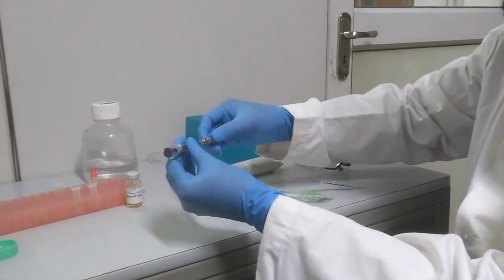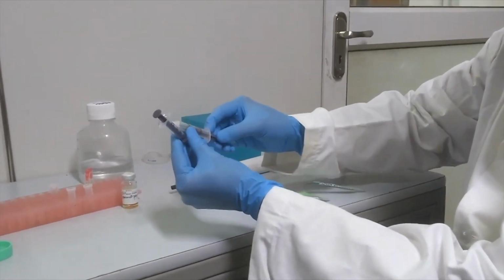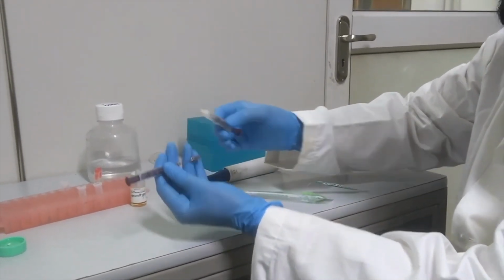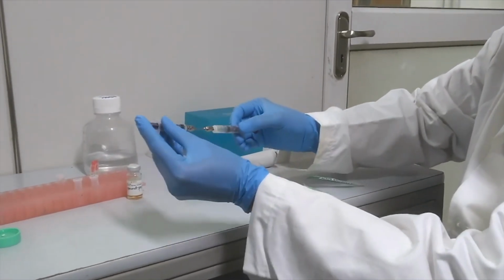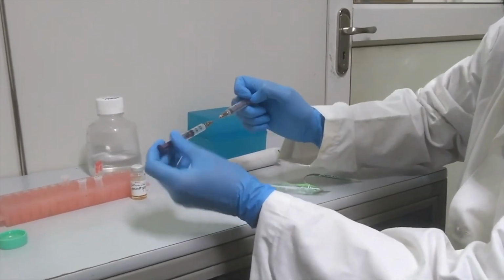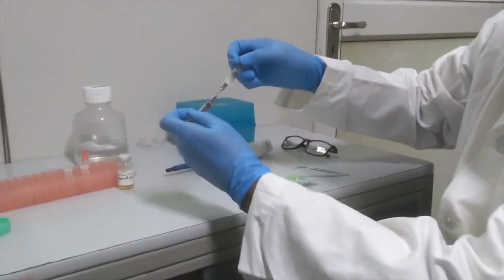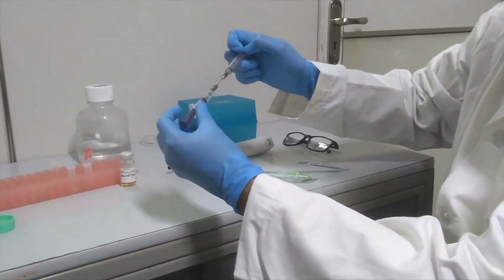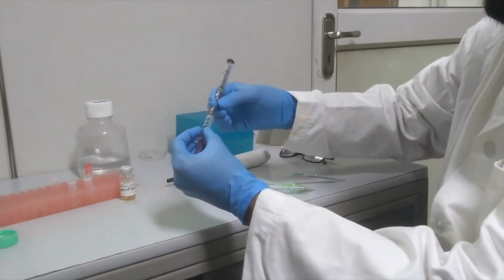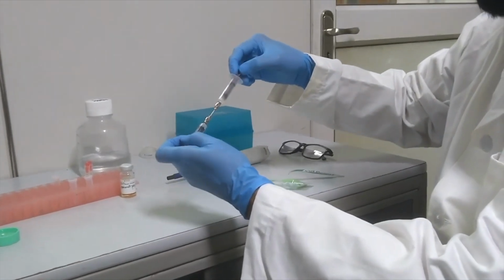Like this. So once you have filled your antigen and the adjuvant in this needle, you push it here, and then you keep pushing from one side, keep pulling from another side. So this process forcefully pushes your material, I mean the oil and the antigen, through this fine needle, and in that process, the emulsion is formed.